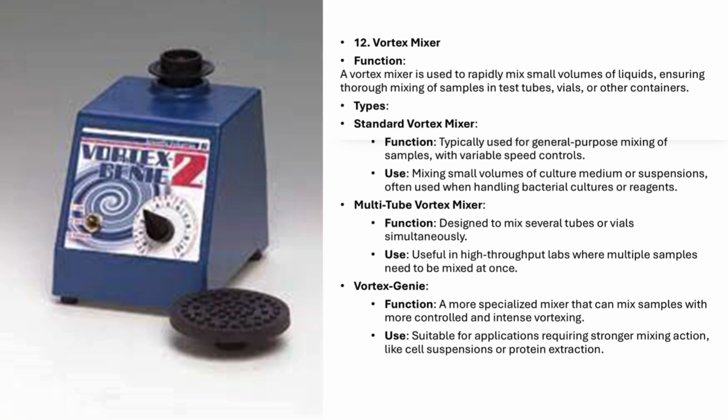Vortex mixer, rapid and efficient mixing in microbiology. Now, let's look at a tool that's essential for ensuring thorough mixing in the lab, the vortex mixer. This device rapidly mixes small volumes of liquids, ensuring that samples in test tubes, vials, or other containers are well blended and homogeneous. It's especially useful in microbiology labs for creating uniform suspensions and reagents.